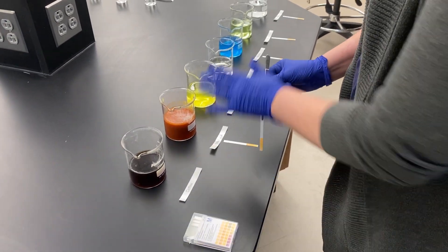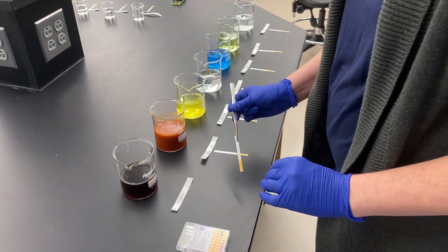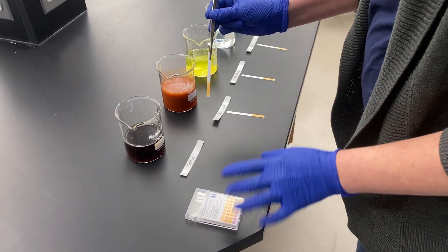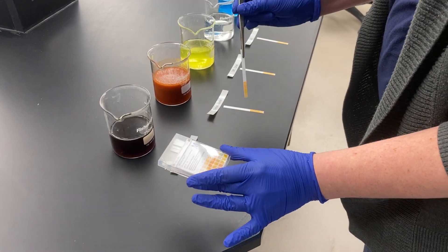In this video we are going to test a wide range of different solutions that you could have at home and see what their pH is. I have a pH strip that I'm going to stick into each solution and a pH indicator range to compare it to.